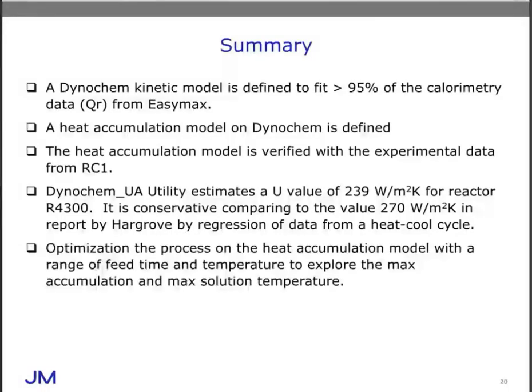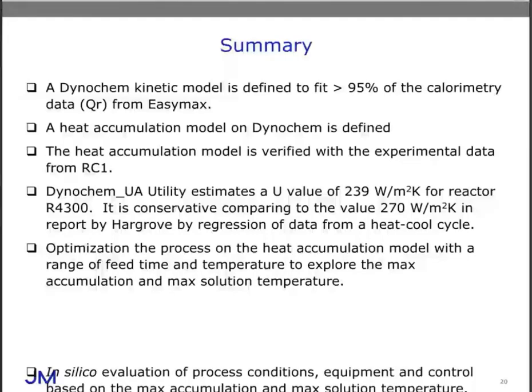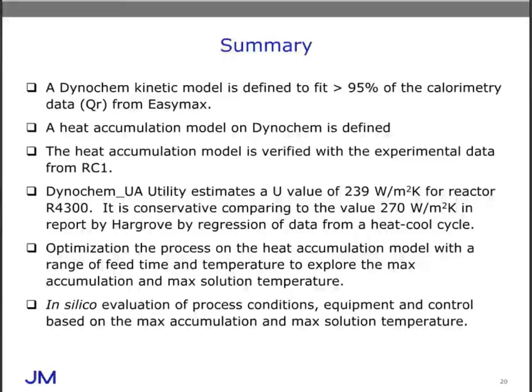We believe this model will allow us to optimize or minimize the heat accumulation based on the feed time and temperature, so that we can achieve efficiency and safety. The benefit is that this model will allow us to run the chemistry on the computer without actually doing the lab work, and really save a lot of material and time, and still give us satisfactory results.